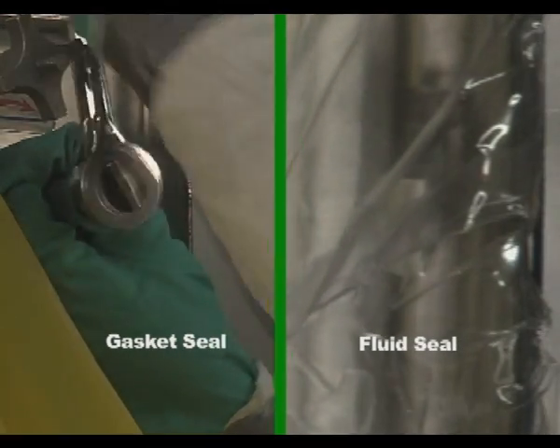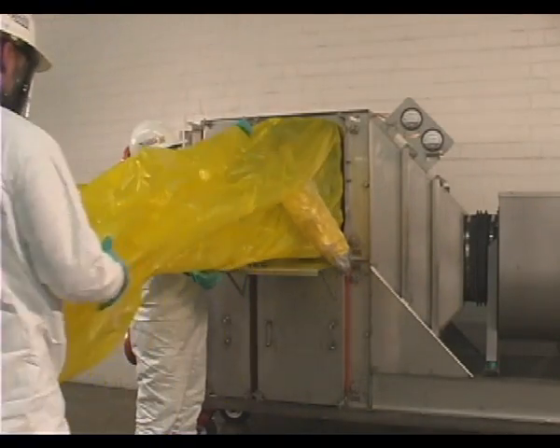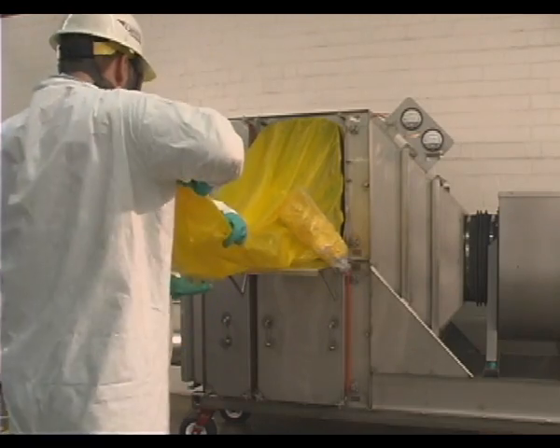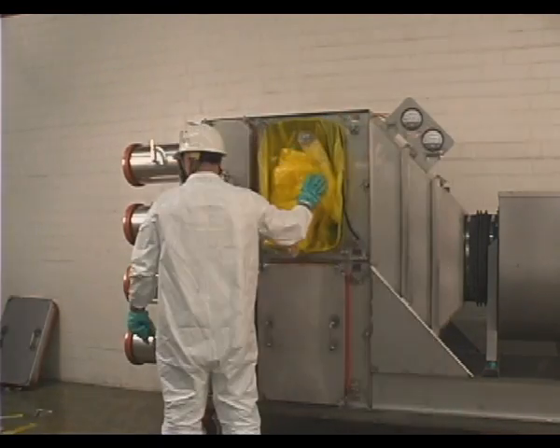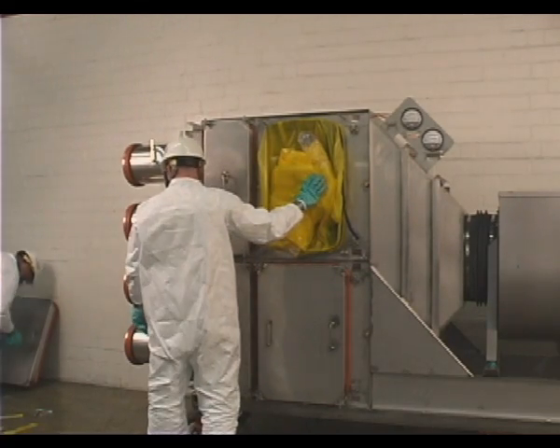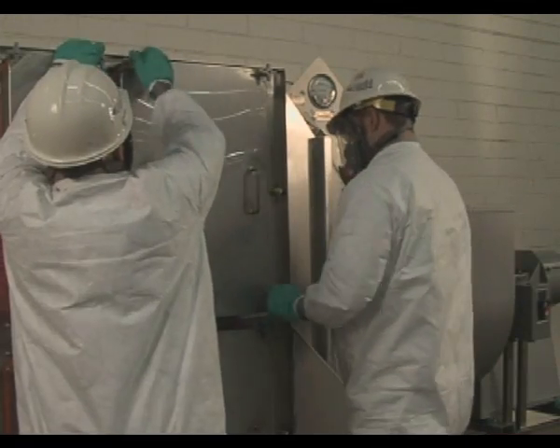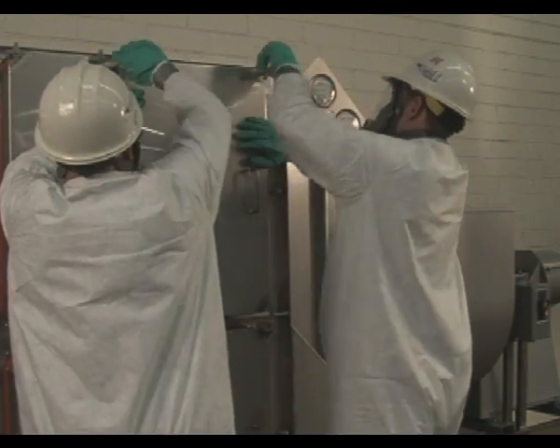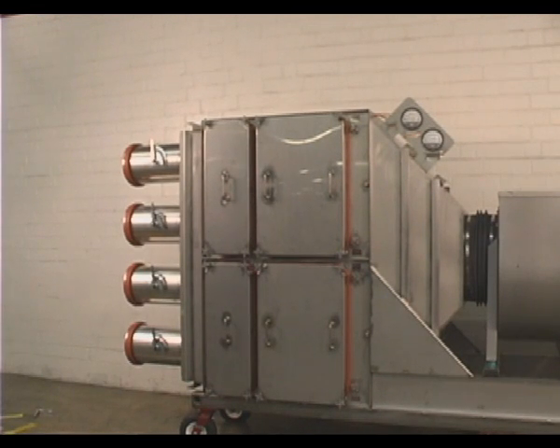Seal the filter by closing the locking mechanism. Extend the bag out completely, then fold and roll the bag toward the housing until the bag is tucked neatly between the bagging ring and the filter access port. While holding the change out bag in this position, replace the housing access door carefully. Tighten the door knobs alternately by turning clockwise until the door is sealed against the housing. The filtration system is now ready for operation. Open upstream and downstream dampers and restart the system or redirect bypassed airflow through the system.